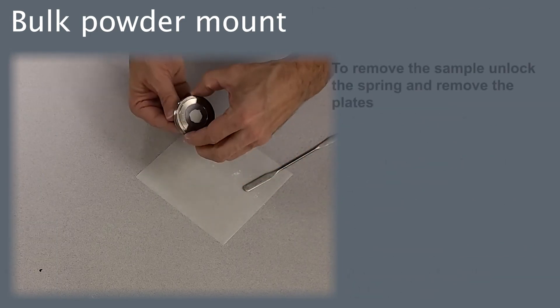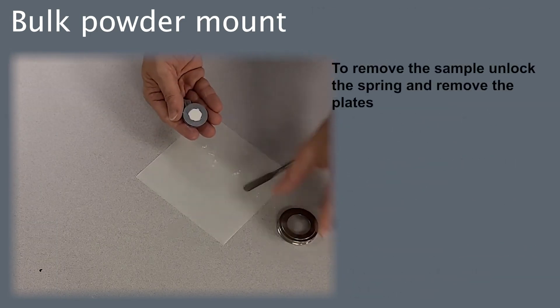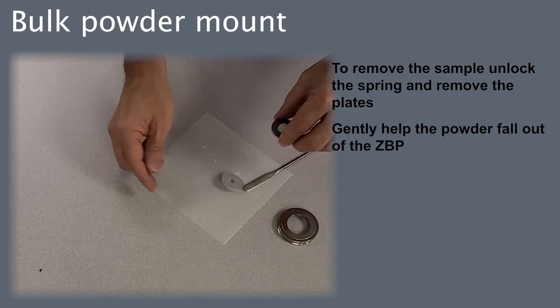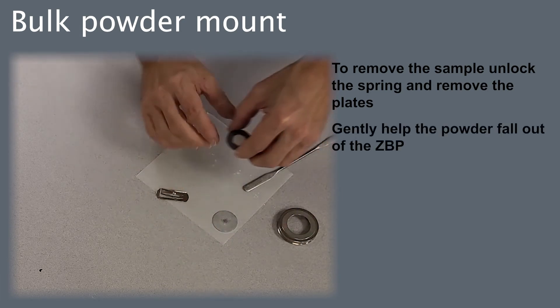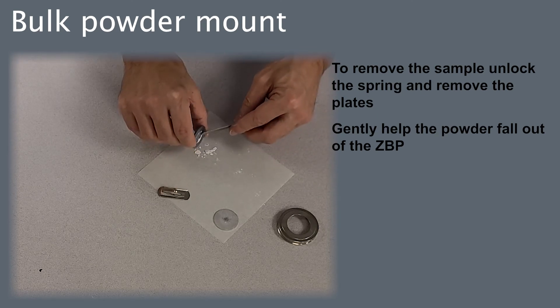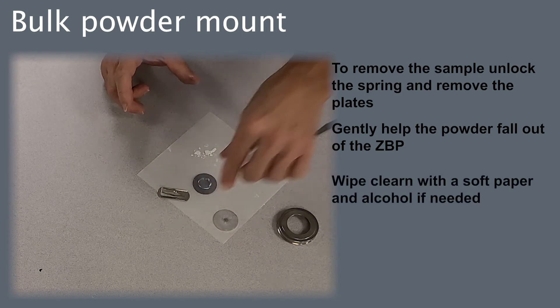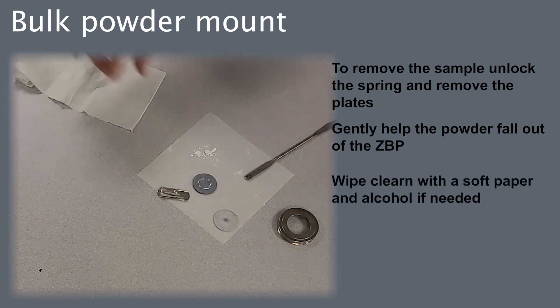To remove the sample, unlock the spring and remove the plate. Gently help the powder fall out of the zero background plate. Wipe clean with a soft paper and alcohol if needed.